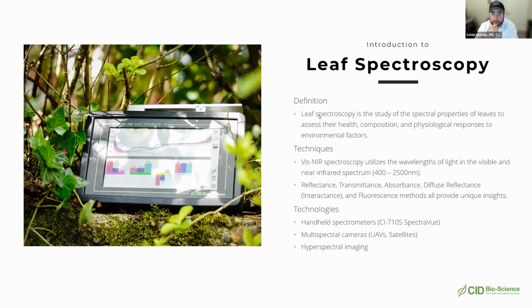The next is, how complex is it to model the spectrum of a metabolite to determine its contents in a leaf using Spectravue? Any suggested procedure? So yeah, model building, I would say it isn't the least complex process in the world, but it is also one that's very easy to understand once you know what goes into building a model. And I would really recommend that you check out our YouTube and look at our chemometrics series and how to build models. Because there's a lot that goes into planning, especially on the planning side, before you even start collecting data.